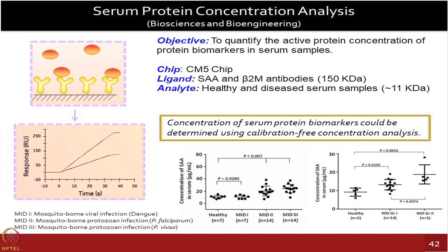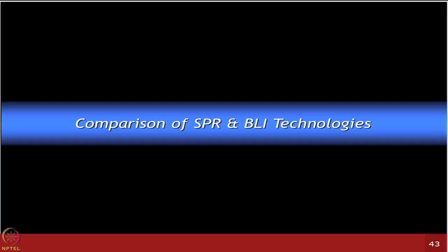Again, sometimes you have to develop these assays in the beginning, so you need pure protein. It's a good idea to try out something if you are planning to do this kind of experiment with known proteins for which you have the purified proteins available. Build the confidence and the assay conditions from those, then you can apply them to some unknown compounds as well.